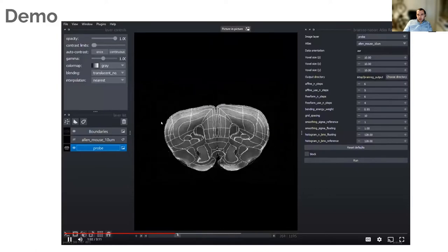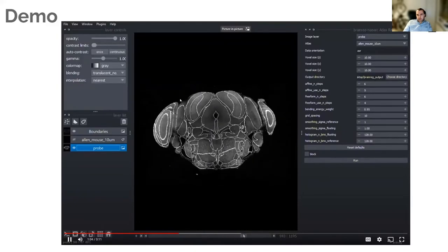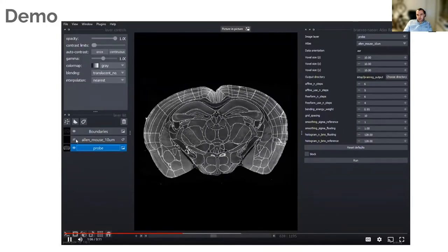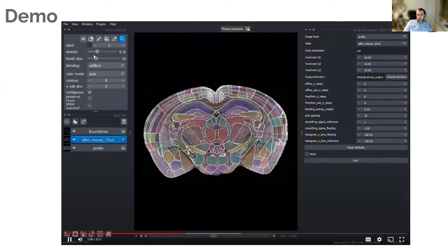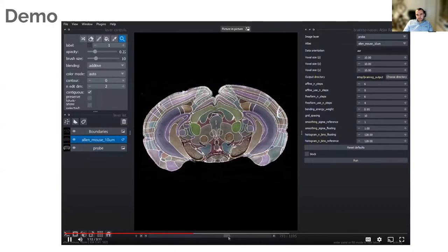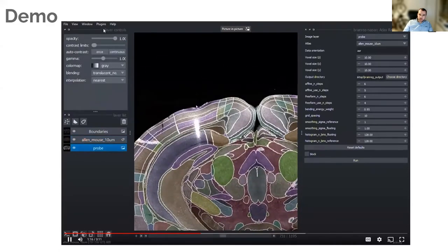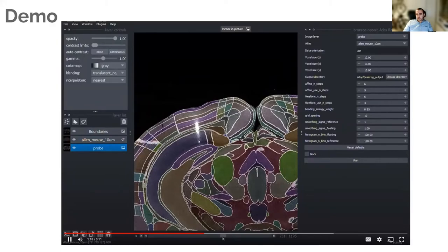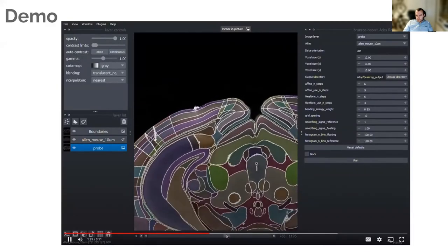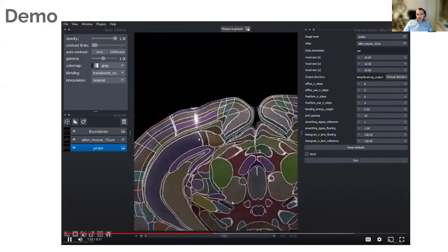When the registration is complete, the brain region boundaries will be overlaid onto your image, and we can also add the specific regions, in this case from the Allen. We can see that, as we thought, this probe track does go through primary visual cortex. But we want to quantify this and know exactly where each of the probe recording sites are.